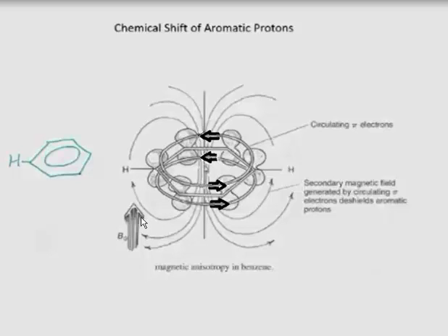So the net magnetic field that this aromatic proton experiences is the sum, a combination of the external field and the local field created by the magnetic field line. You can see that the net magnetic field has increased, and the increase is great enough it causes a marked de-shielding effect on the signal created by the proton, very far towards the left.